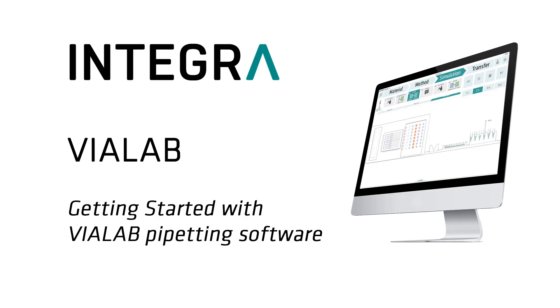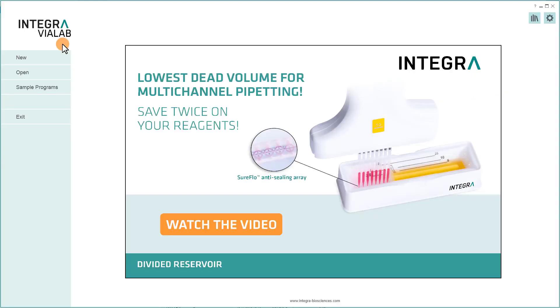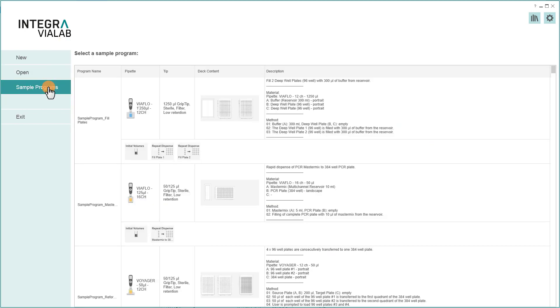Getting started with VIALAB. After starting VIALAB, have a look at a sample program to get a first impression.